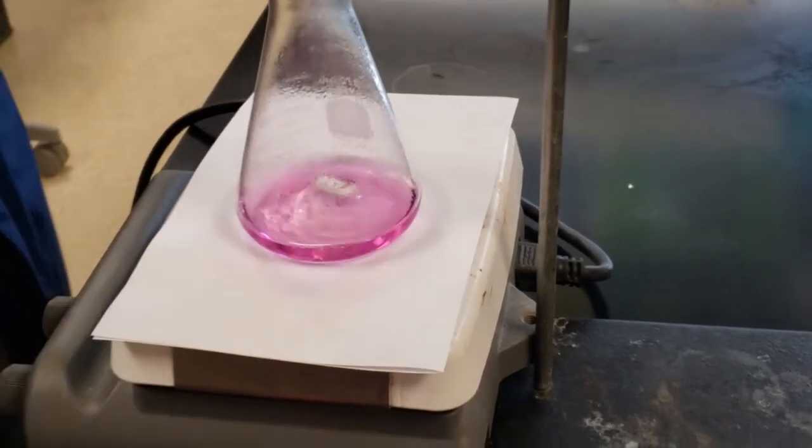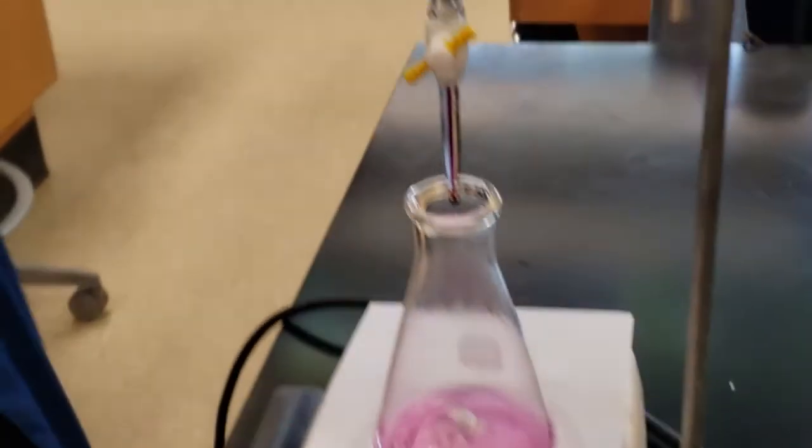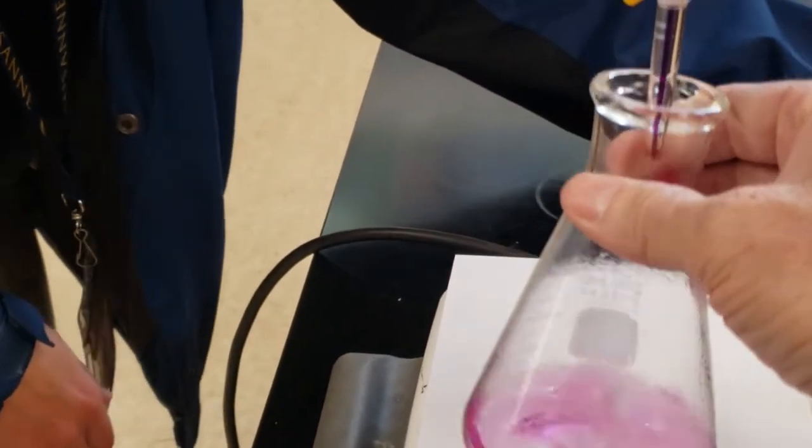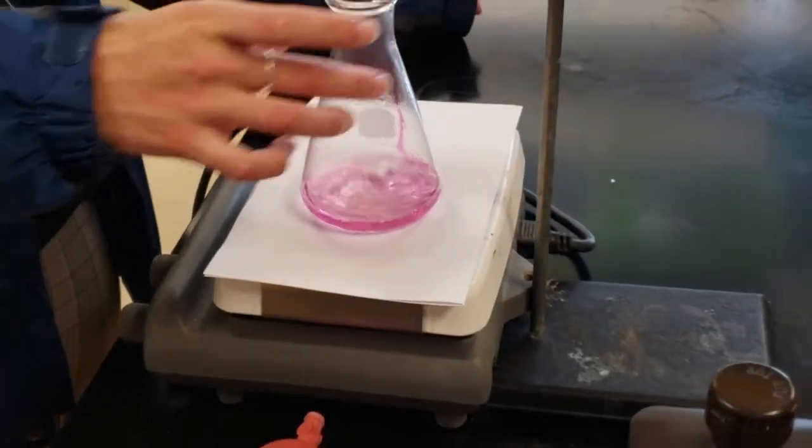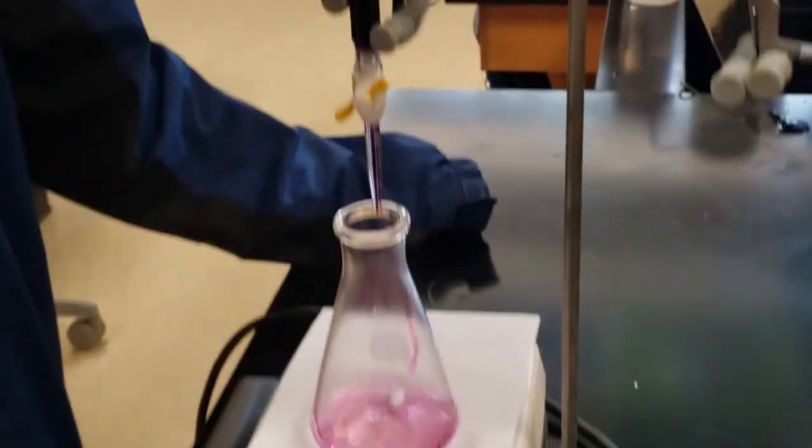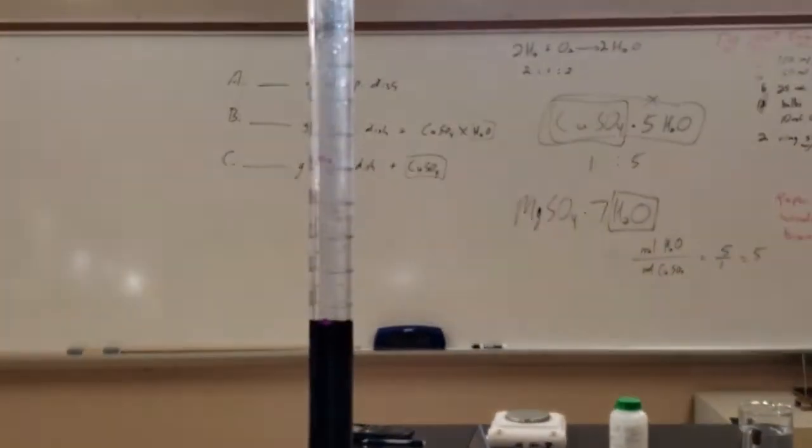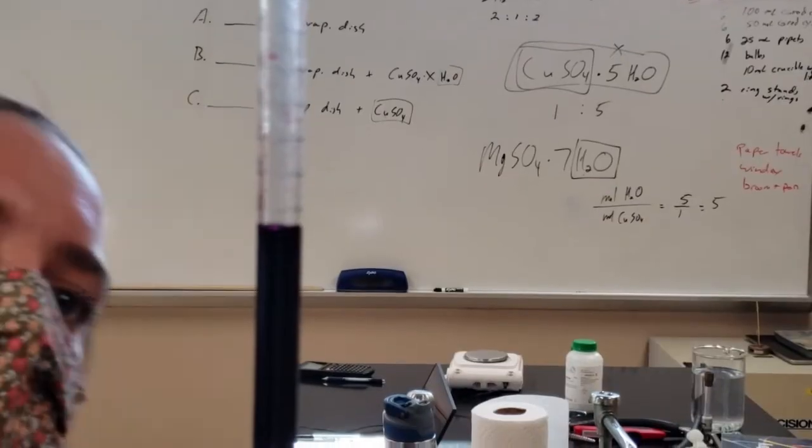Now there's one little drop still sitting there. It's already past the stopcock, so it's already been measured. We're going to go ahead and drop it in anyway. It won't make any difference. It's already been measured. Now that we're at the equivalence point, we're going to read the number and we're done.